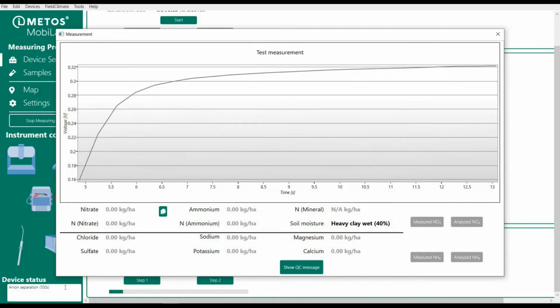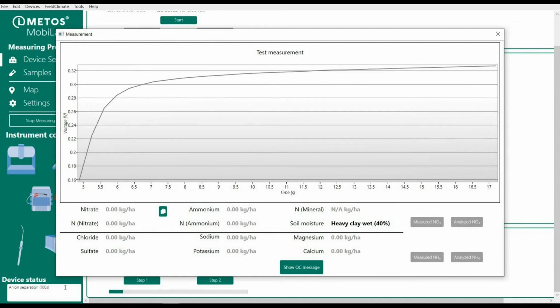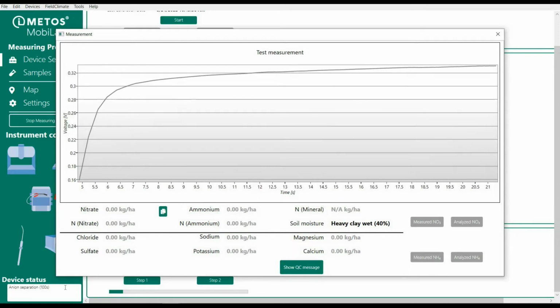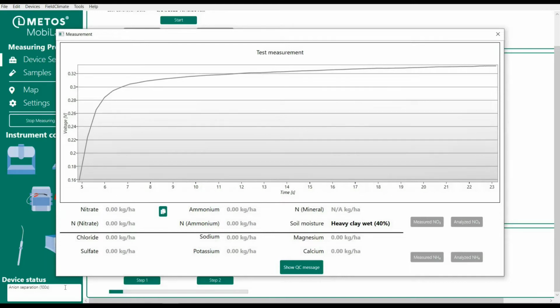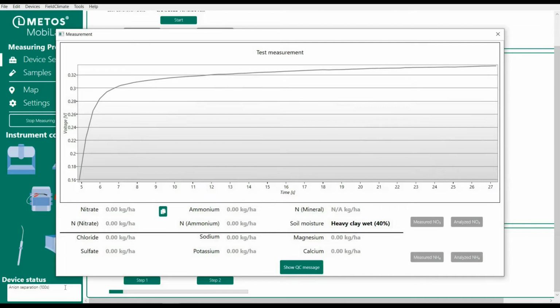This is the baseline. As it is displayed here, it's perfect. It should be smooth and should not have any disturbances or unwanted ups and downs. There will be examples on how a baseline should not look like and what to do in which case.